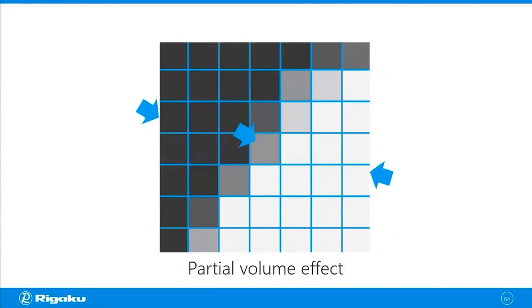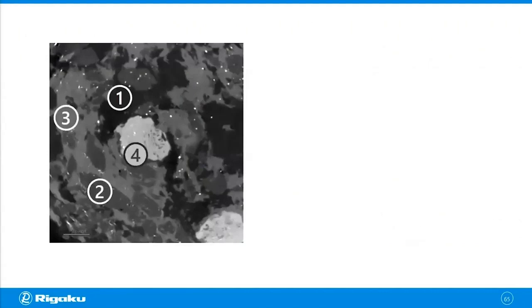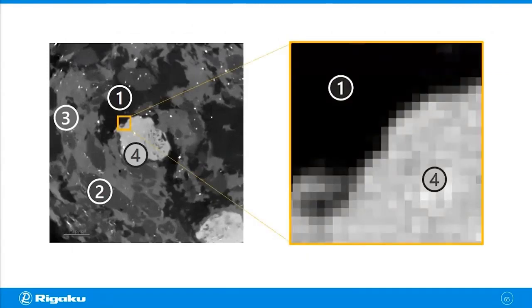Now let's go back to the original image. So in this example, you can see at least four distinct gray levels. And let's zoom into the interface between phases one and four.